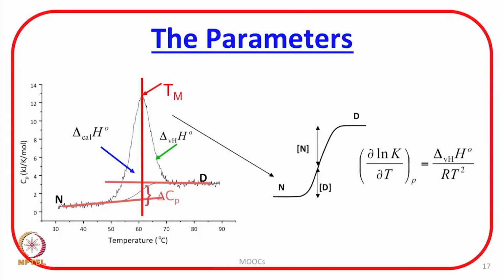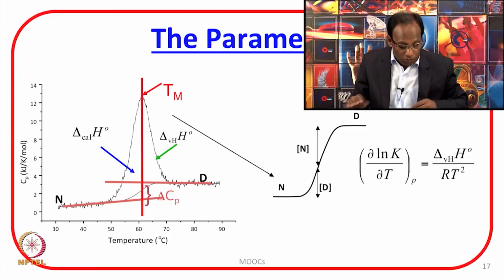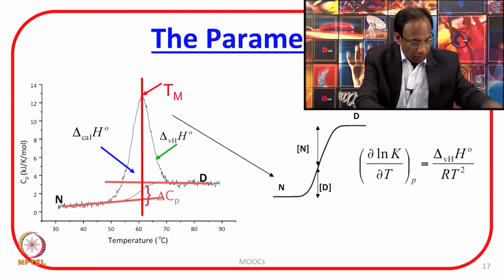And suppose if I integrate this differential scanning calorimetric curve, you integrate, the integrated plot will look like this, right.